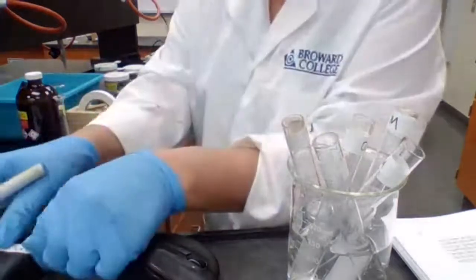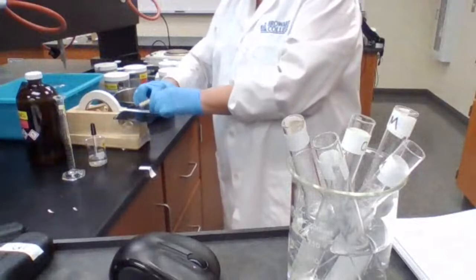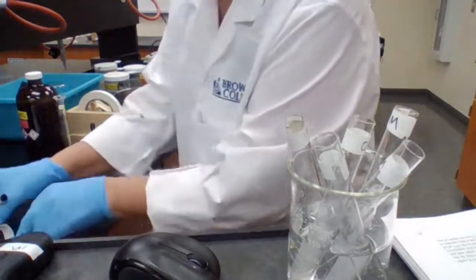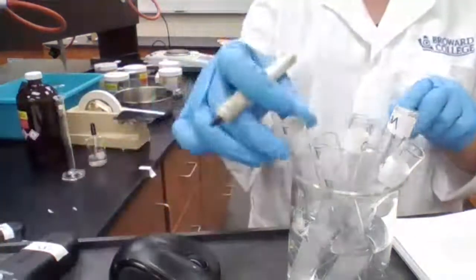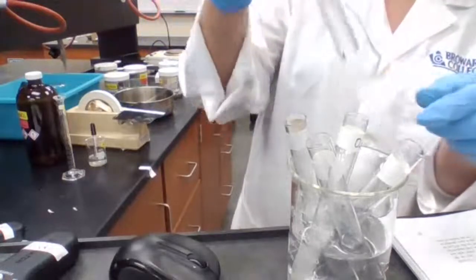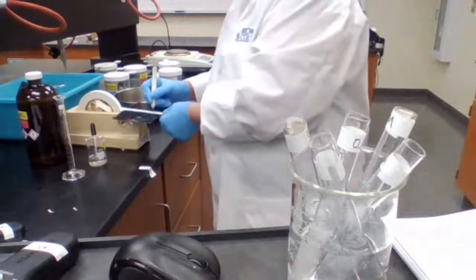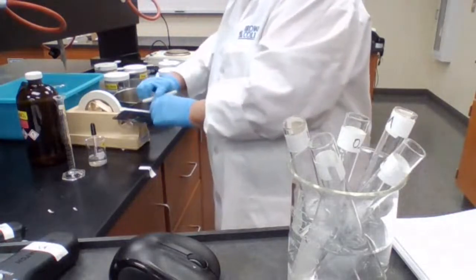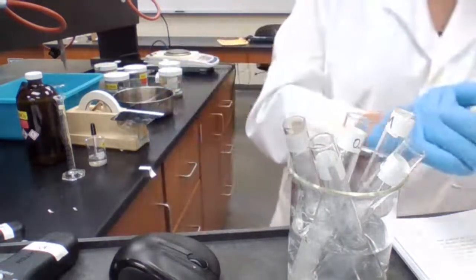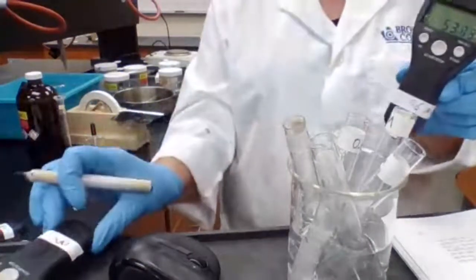This one is for the 1 molar, 0.8 molar, so I know which one is which, and 0.6 molar. So I have my timers also labeled.